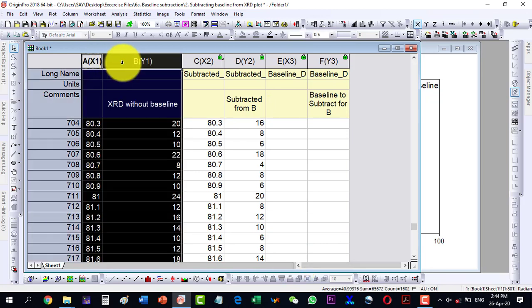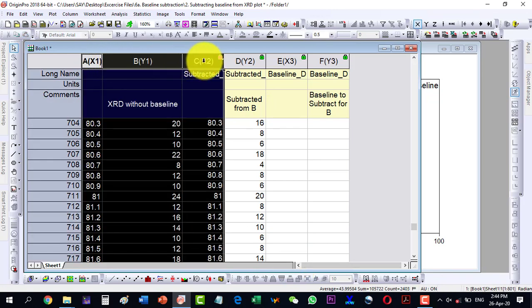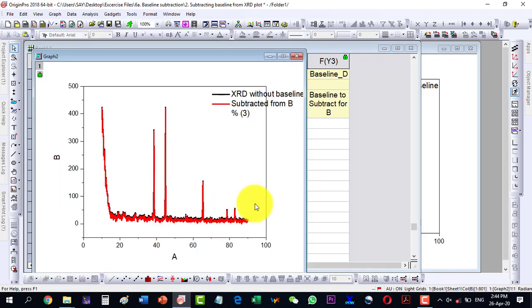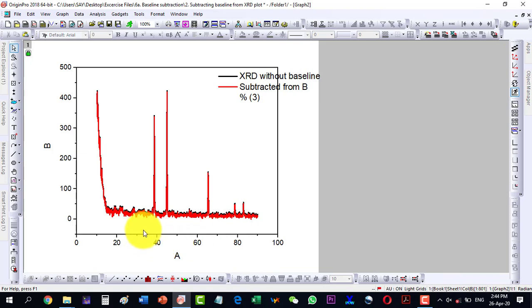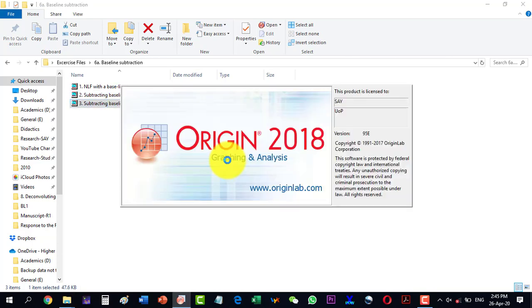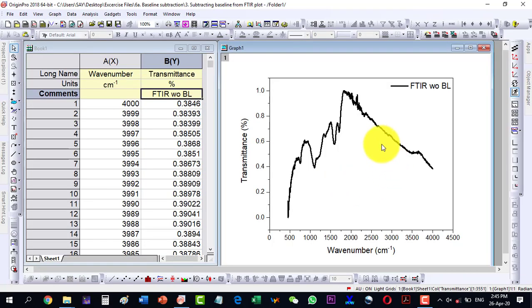We can see here that there is not much improvement with the constant straight line mode, but the user-defined mode in which we can refine our points is very good compared to the constant mode. Similarly, we can subtract baseline from an FTIR plot as well.